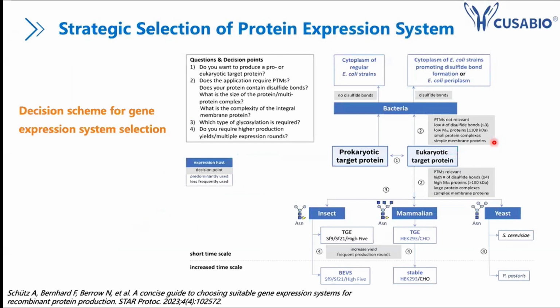Before I talk about some challenges that I will cover later, here I want to highlight the selection of the protein expression system. As you see, this is the decision scheme for gene expression system selection. The basic idea is that you want to know the features of your protein. You need to know whether your protein comes from a prokaryote or a eukaryote.